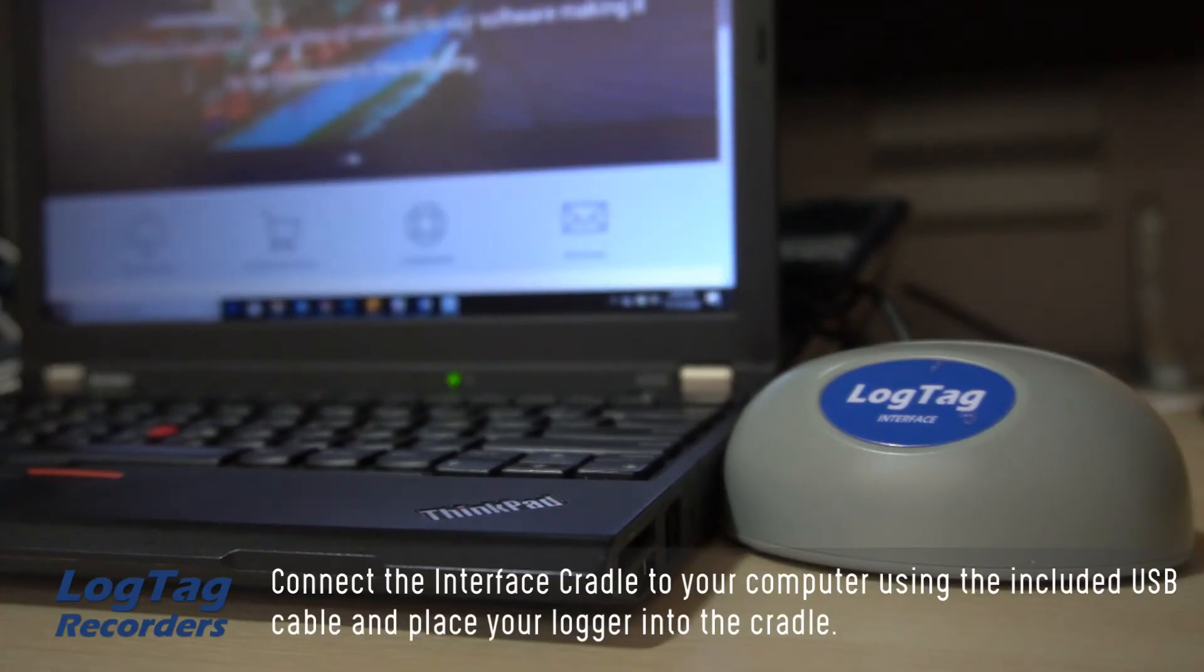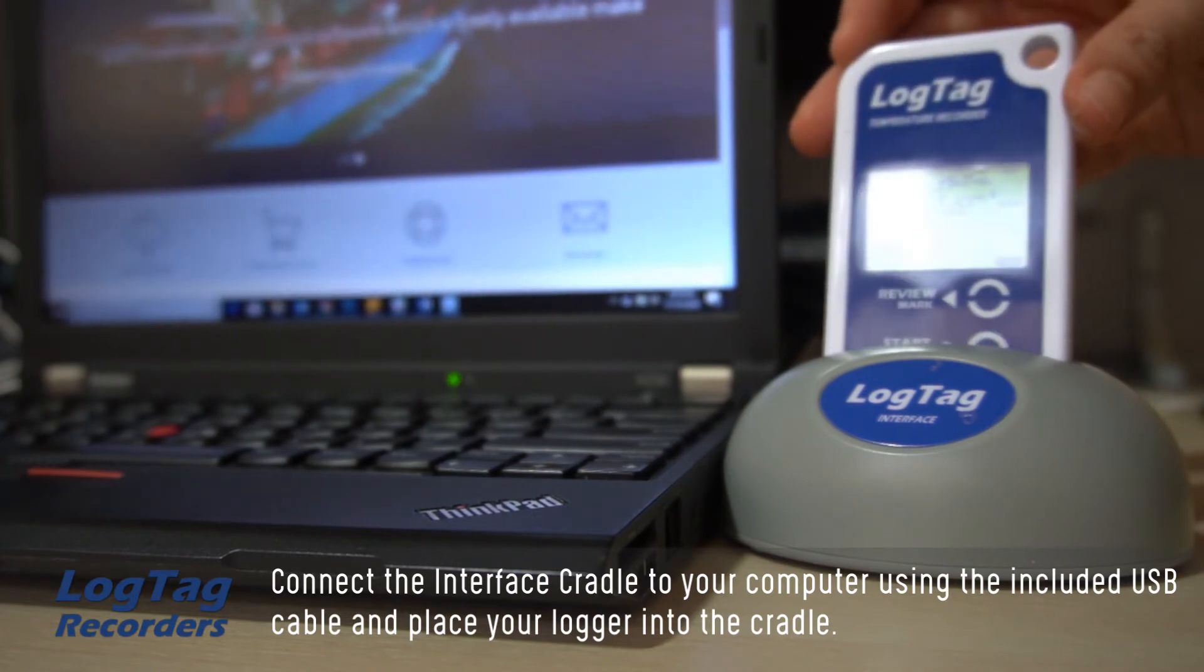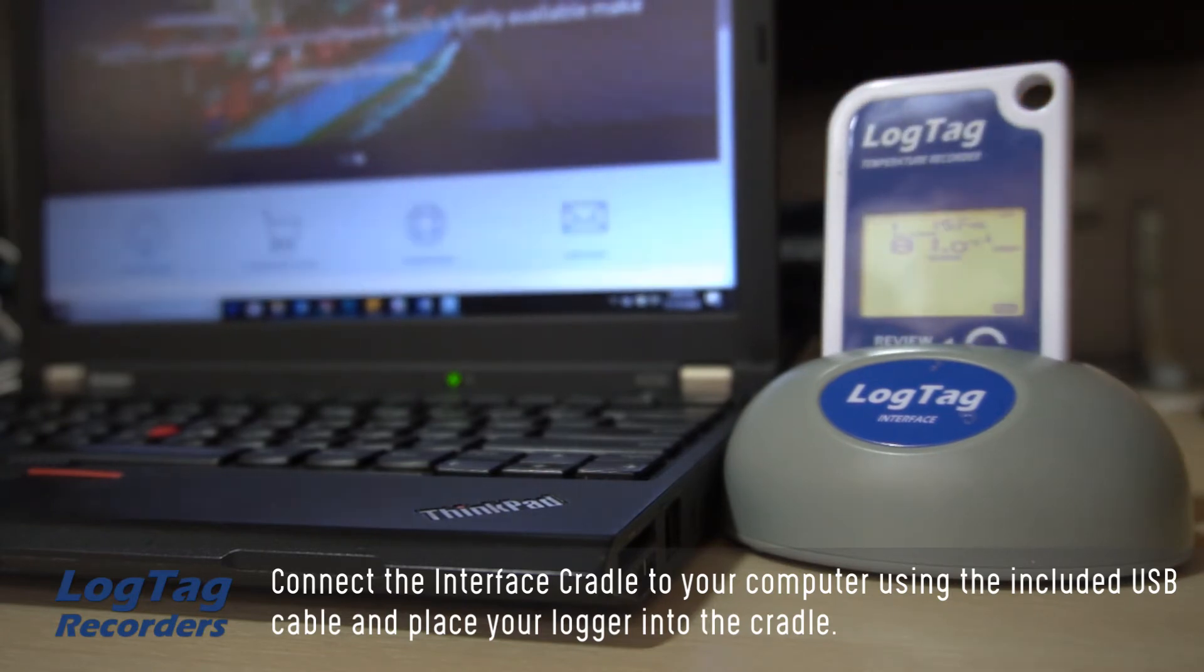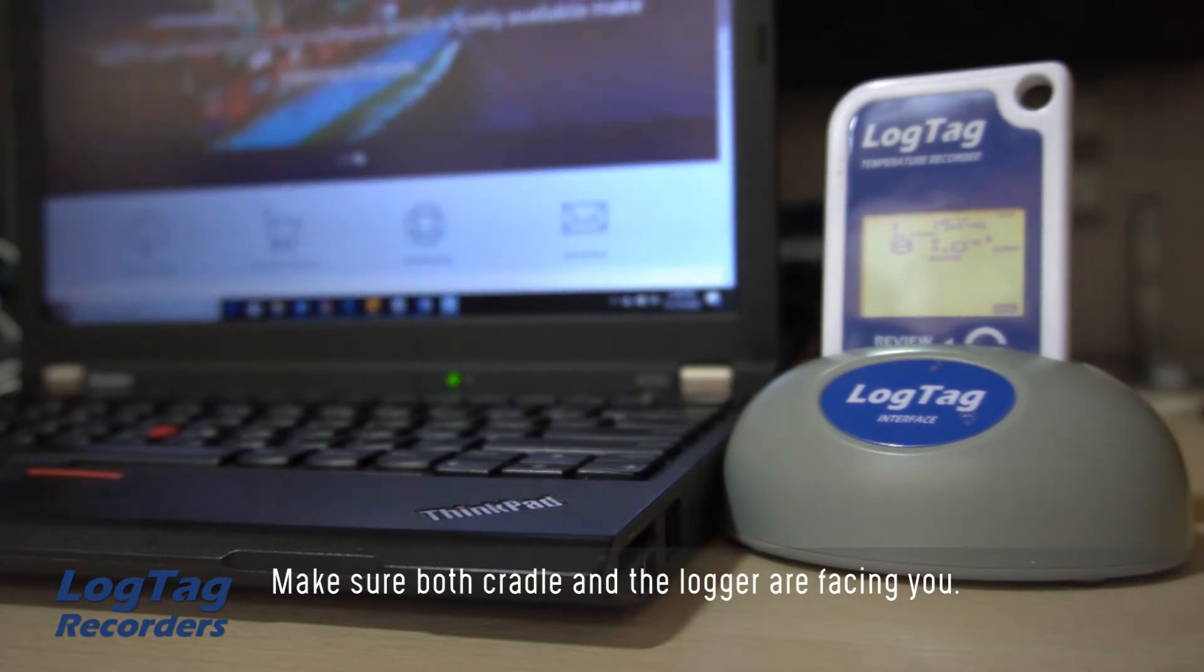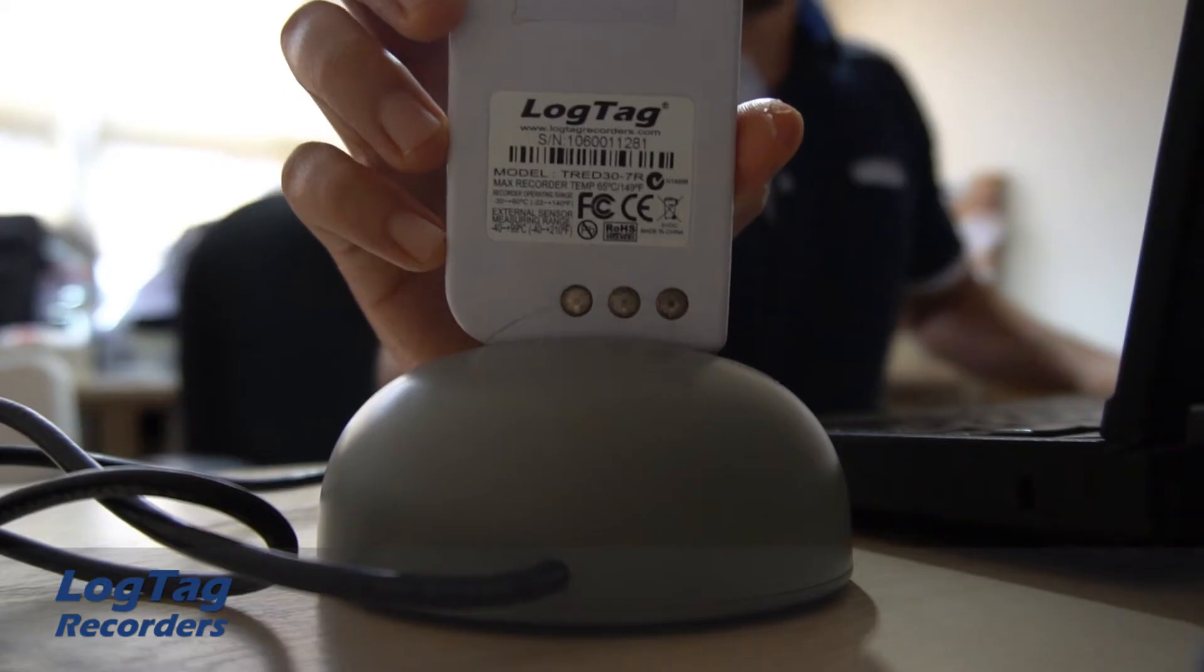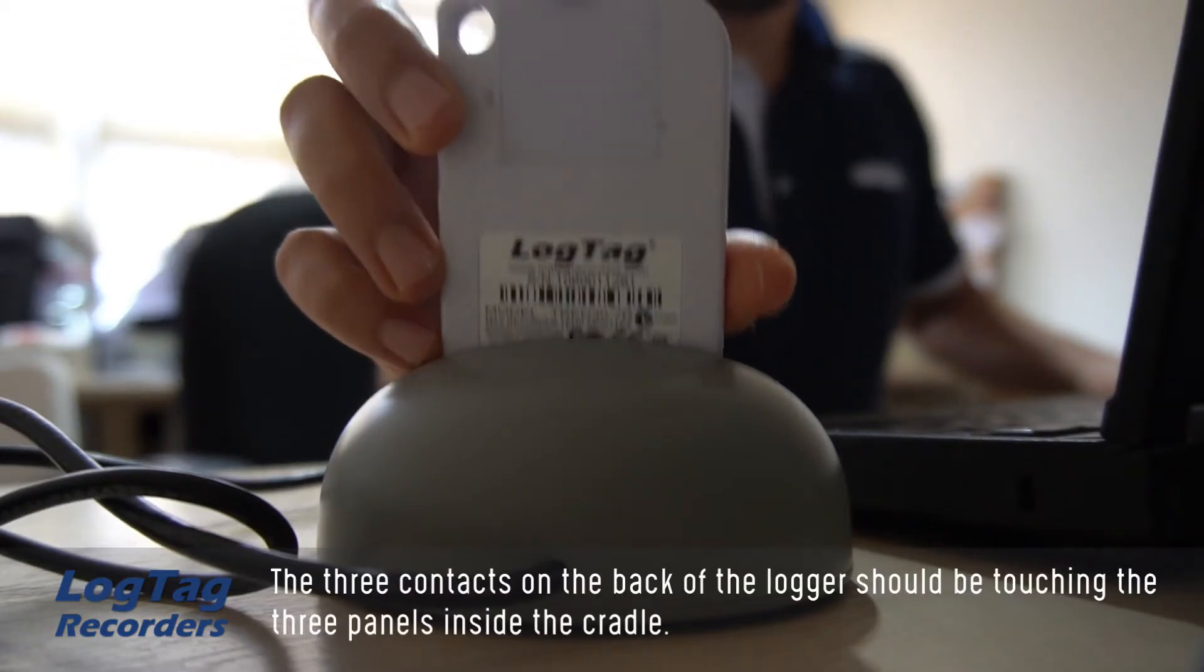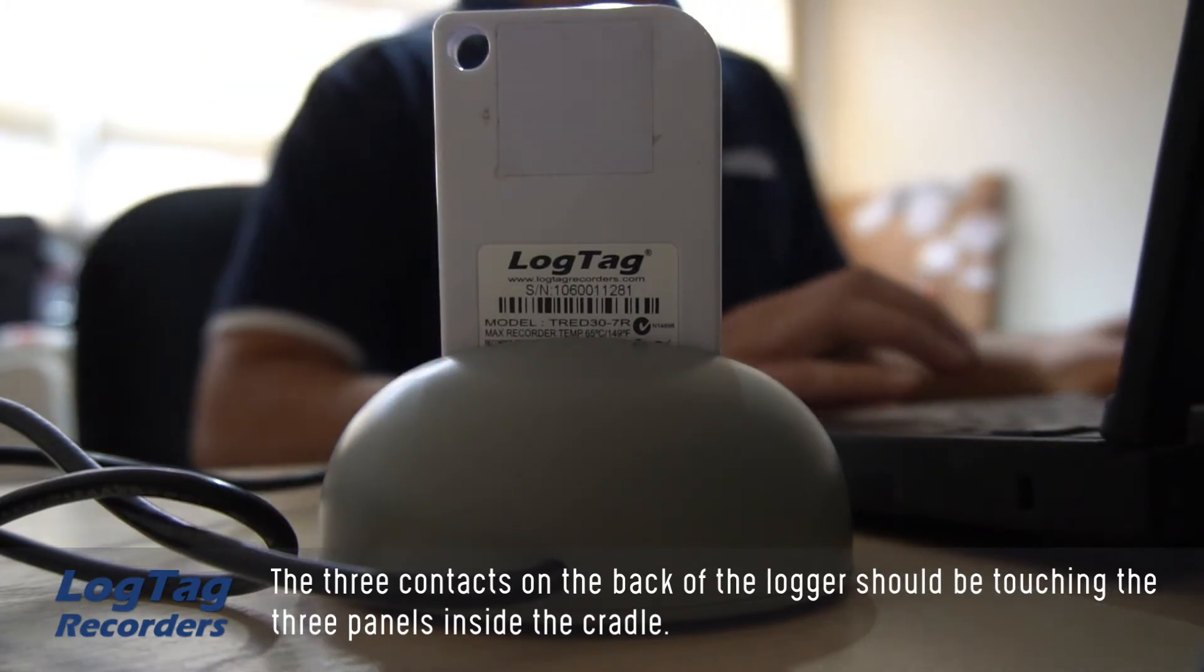Connect the interface cradle to your computer using the included USB cable and place your logger into the cradle. Make sure both cradle and the logger are facing you. The three contacts on the back of the logger should be touching the three panels inside the cradle.